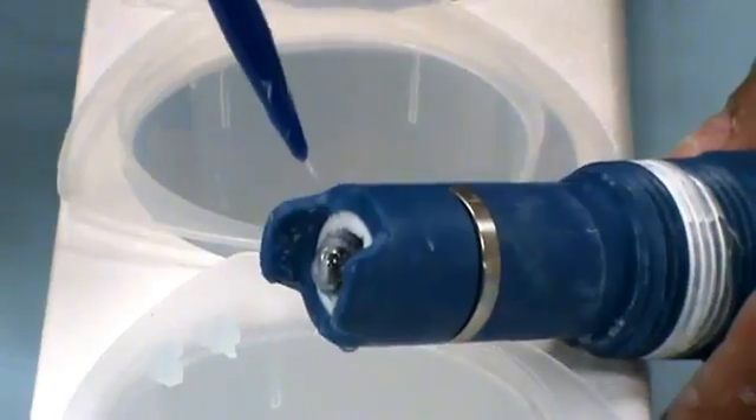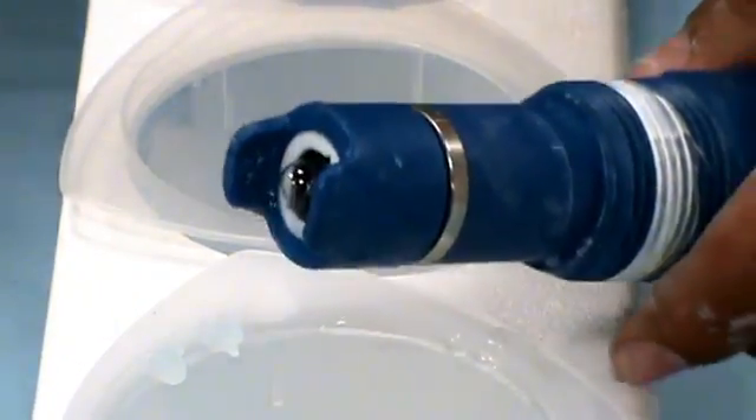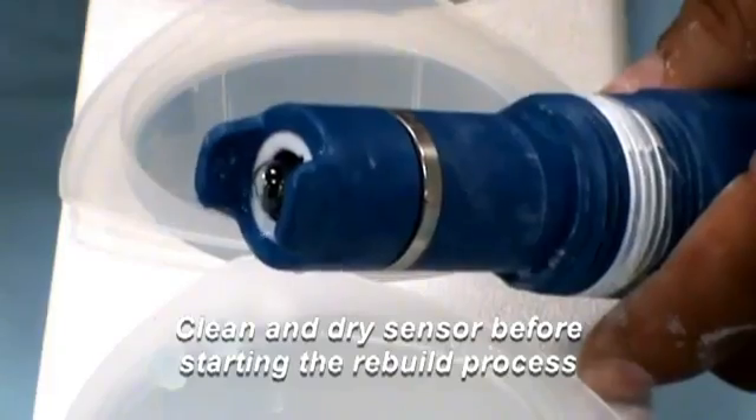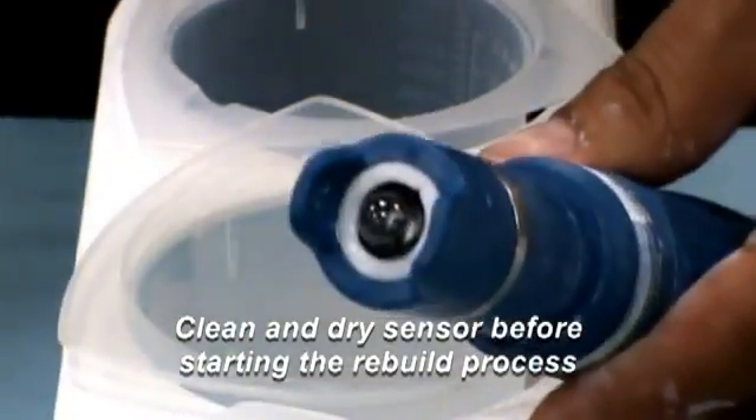Before you start to rebuild the sensor, make sure that the sensor is pulled out of the process pipe or tank. The sensor should be rinsed off from all process liquids and dried off by gently patting dry.